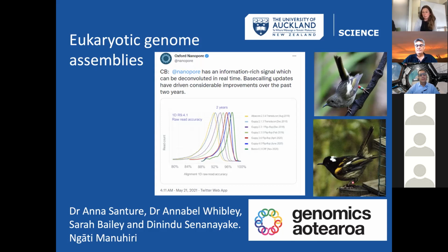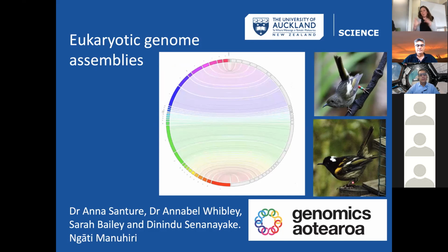It's a really, really exciting sequencing technology to use, and it enables a lot of the research that we can do. And this is my final HeHe assembly. I'm comparing, we generated 2, a male first, and we then learned from all our mistakes and generated a female too, and they're very highly contiguous and really nice quality genomes.